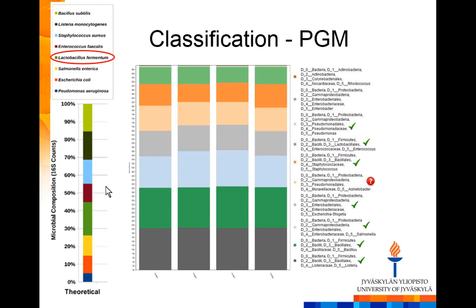I got this data late last week, so I haven't had time to see everything. I got the MiSeq data on Wednesday, so I need to take a look into what this is. But apparently there is something funny going on with the pipeline, maybe with chimera identification. That's my best guess, that for some reason it identified some sequences as chimeras or some chimeras as sequences.